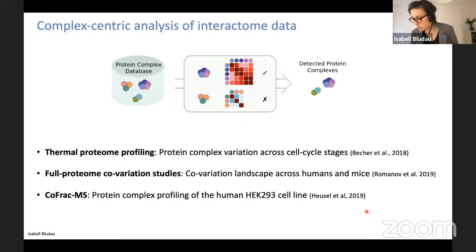So we have a question here, I'll quickly check. Which type of software do you use to assess the statistical significance of interaction results? In other words, to check if the enrichment of certain proteins is significant. This is a very good question.